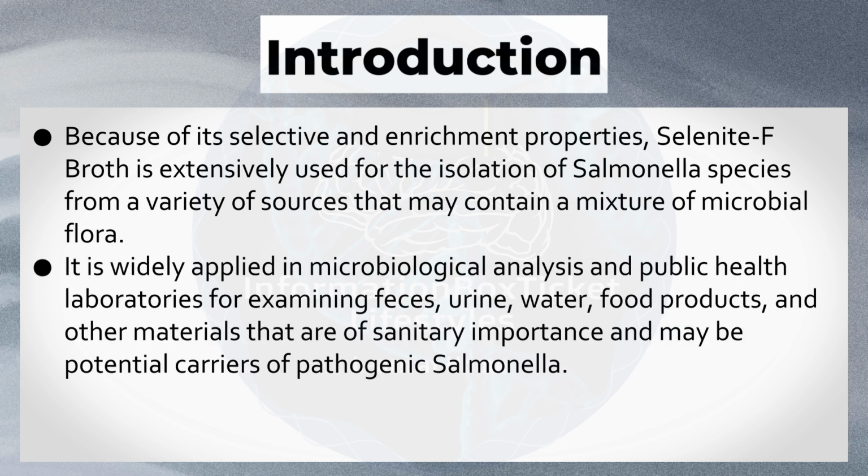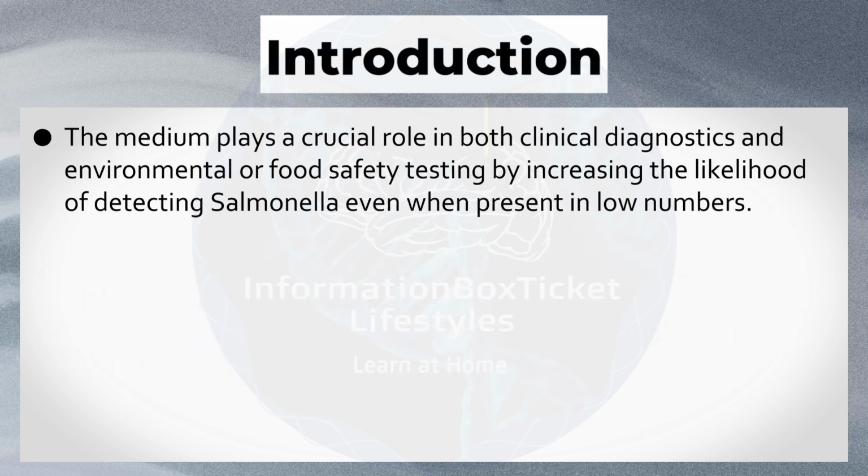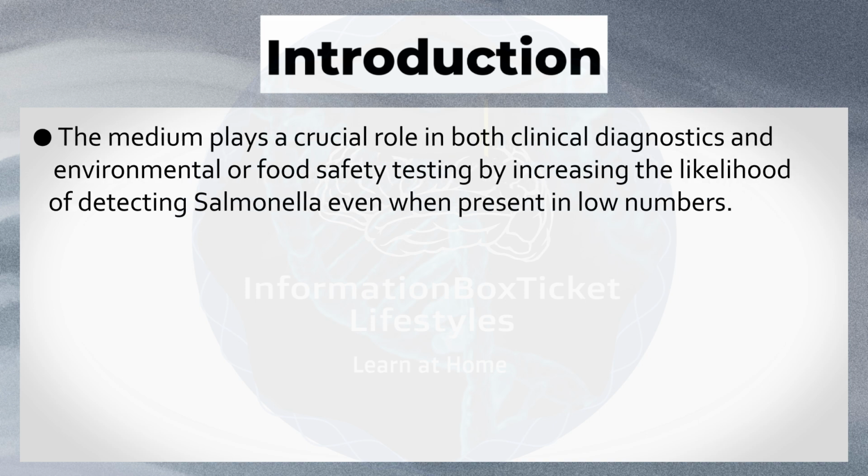It is widely applied in microbiological analysis and public health laboratories for examining feces, urine, water, food products, and other materials that are of sanitary importance and may be potential carriers of pathogenic Salmonella. The medium plays a crucial role in both clinical diagnostics and environmental or food safety testing by increasing the likelihood of detecting Salmonella even when present in low numbers.